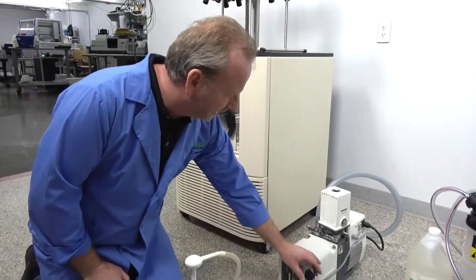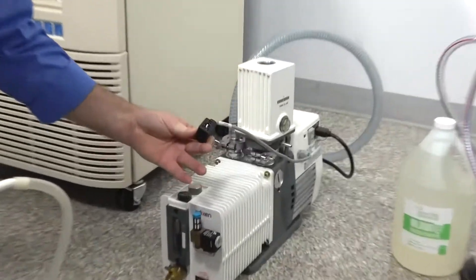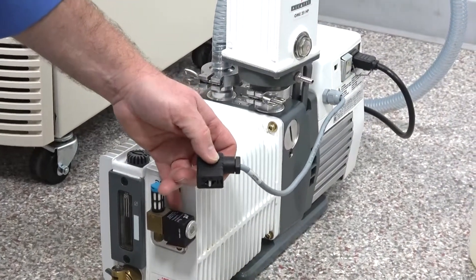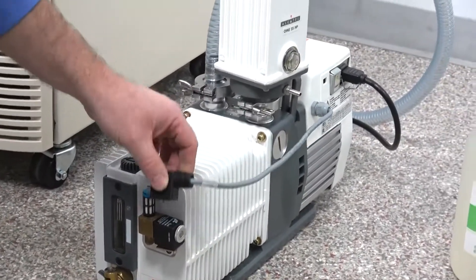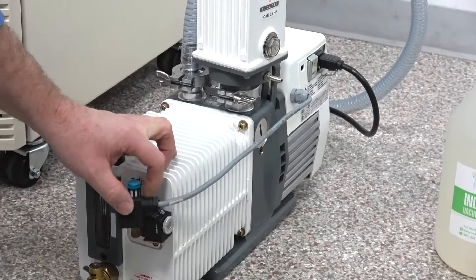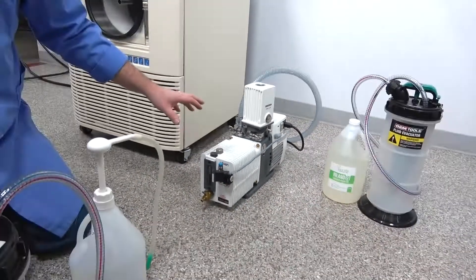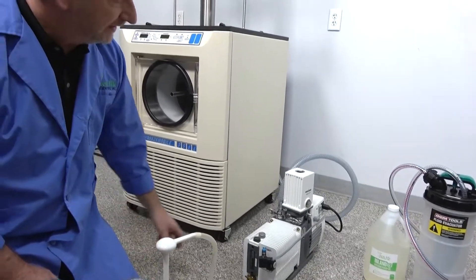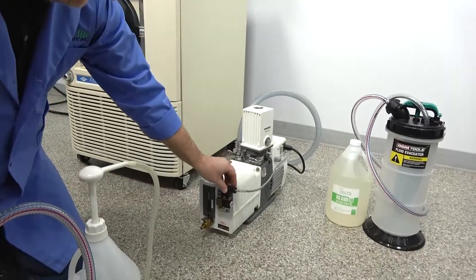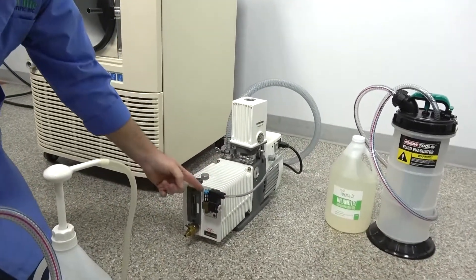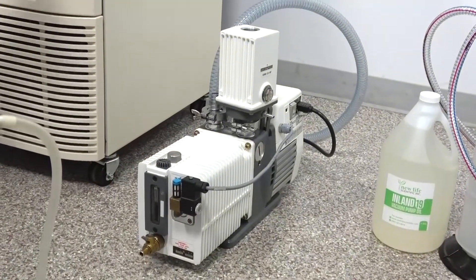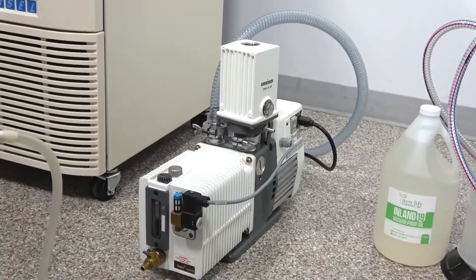But the first thing I'm going to point out to you before we do the oil change is this right here. This is a power that actually powers a solenoid right here that actually allows this pump to do a ballast bypass. In other words, if this is unplugged, this will pull a deeper vacuum and it won't gurgle out excess moisture. If it is plugged in, if we plug this in, you just heard it kick in. Now it's gurgling out moisture that possibly could bypass and it won't pull quite as deep of a vacuum.